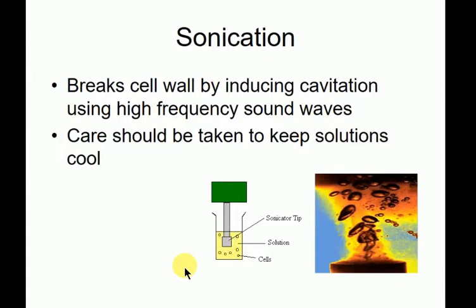So around the outside of this container, you've got a large amount of solution here. In sonication, you can crack quite big volumes of cell paste. Your tip usually sits about an inch deep in the solution, and your container will sit in a bath of ice. You'll do a burst of sonication, and you'll wait, and you'll let the solution cool down again. Then you'll come back, and you'll do another burst.